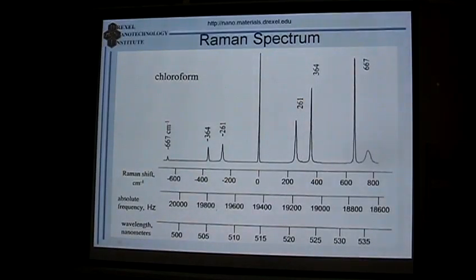Well, there are some people who definitely know this, right? No, it's just a matter of convenience. Let me tell you. You can use a variety of excitation wavelengths. And if I use Raman shift, I can tabulate the data and say the Raman shift of diamond is at 1332 inverse centimeters.